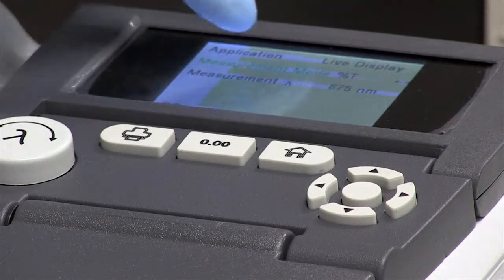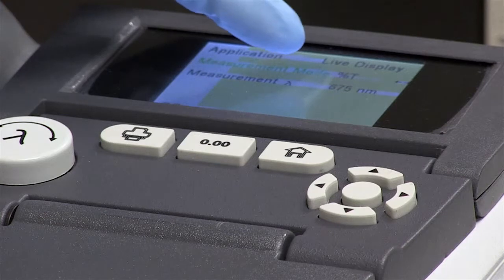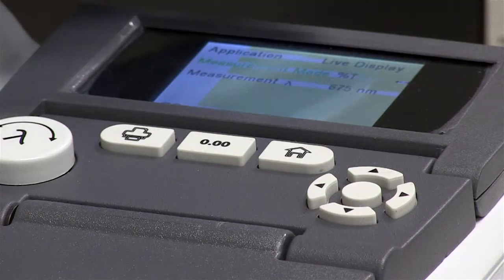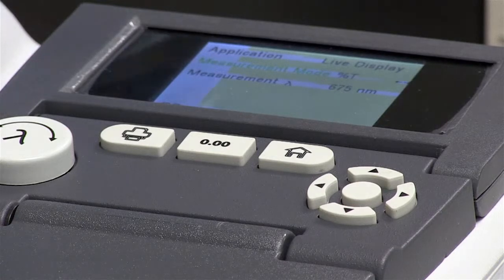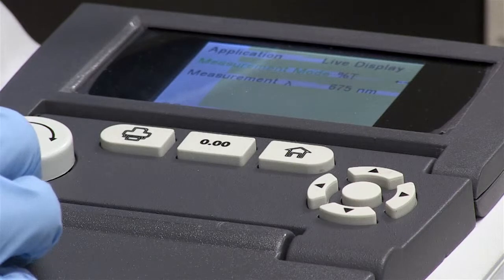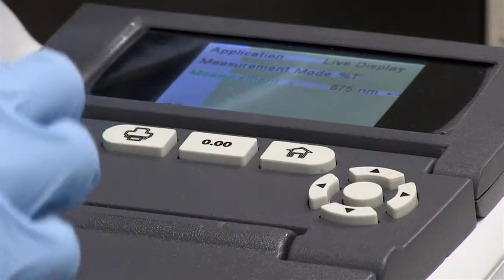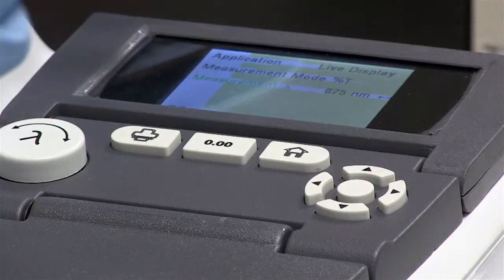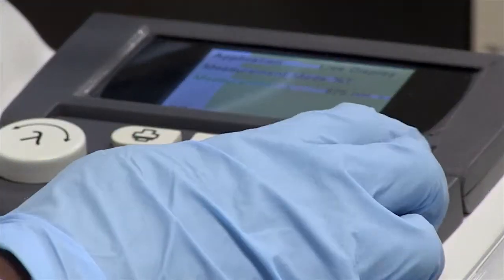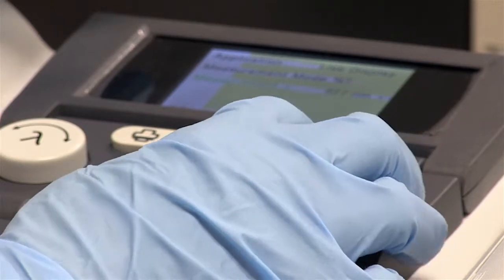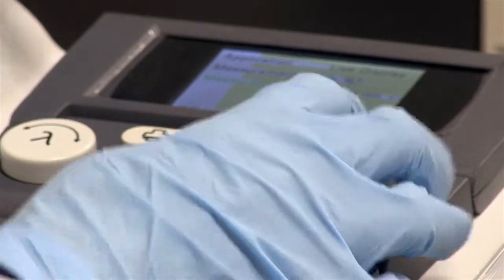Here you can see the measurement mode. Right now it's telling you that you're measuring absorbance at 675 nanometers, which is your wavelength — depicted in nanometers. To change the wavelength using arrow keys, go to measurement mode and press the right or left arrow to change by increments of one nanometer. For example, pressing right goes to 676, 677; pressing left brings it back down to 675.